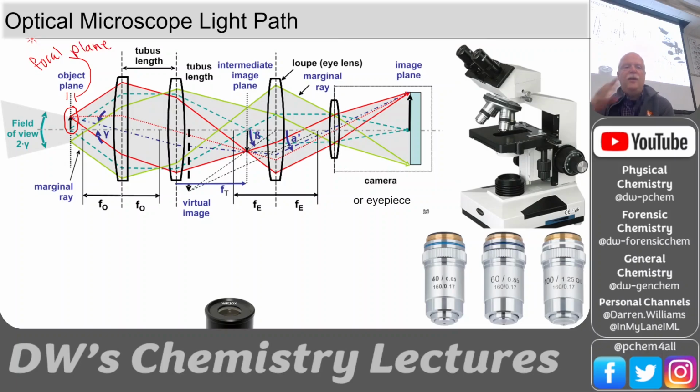And you can see this when you're in a microscope. You're trying to focus. You'll see the image looks fuzzy or odd until you get it in that focal plane, and then you can move that focal plane deeper or further back, and you'll see the image change a little bit as it goes.